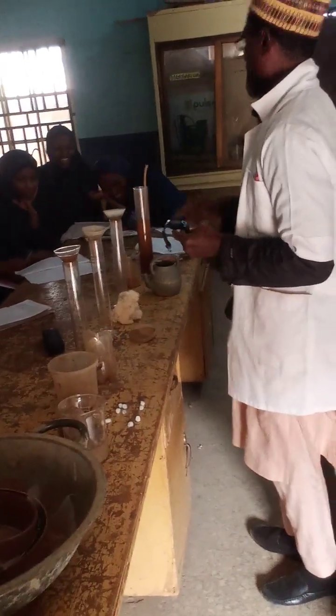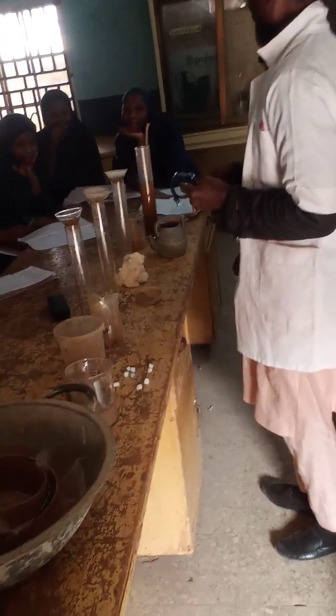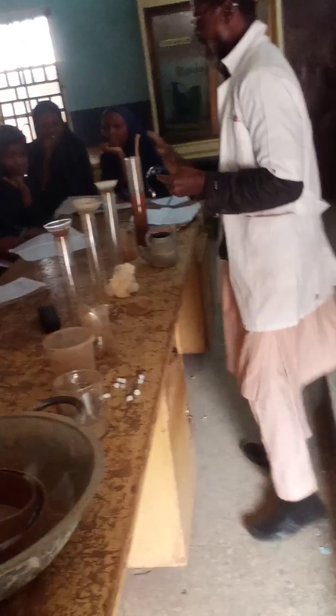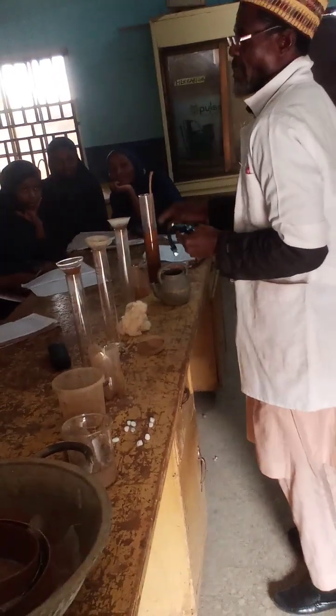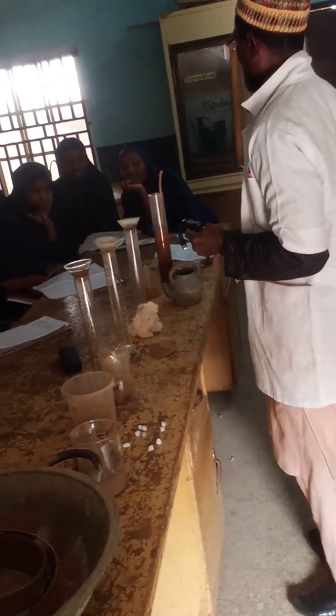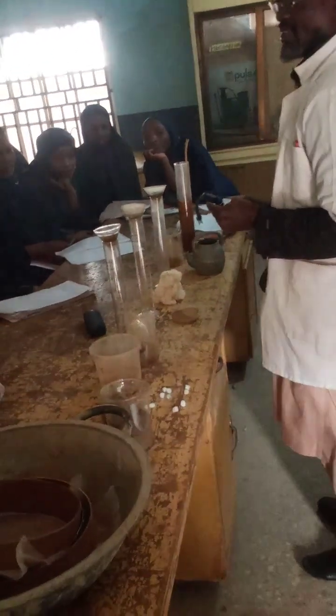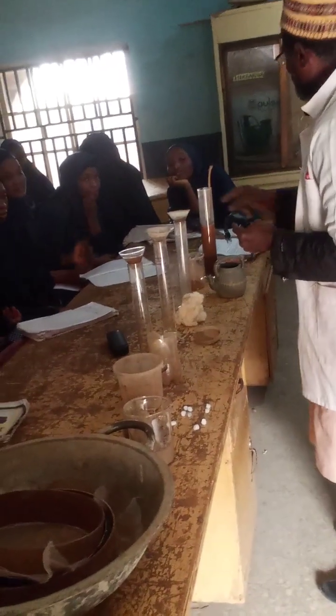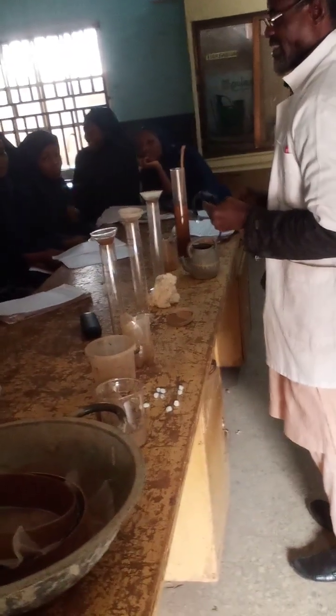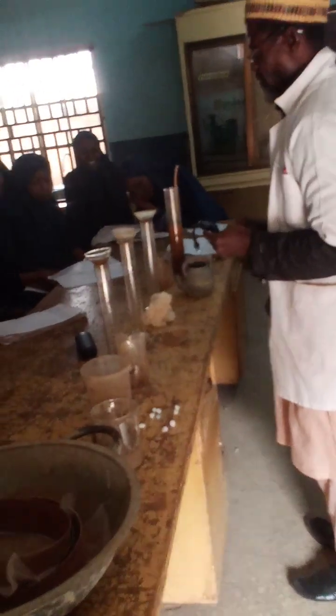The water is going to drain, but it may take time. You can see this one that drains water very fast. What type of soil can it be? Sandy soil. Look at it. It drains water very fast. So the soil will be sandy.